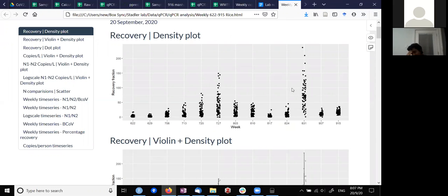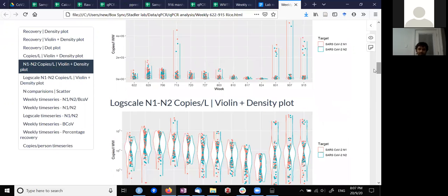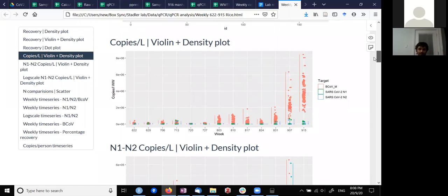There's another inaccuracy in the pipeline. So I'm using a concentration fold from wastewater to RNA as 1,000-fold because I'm putting in 50 ml wastewater and I'm taking out 50 microliter of the RNA extract. But there is a few steps in the middle where they were throwing out a little bit of the sample. So if I account for that, it's actually 500-fold, not 1,000-fold. If I adjust for that, even that will take this a bit down. Okay, I see. So those are the two explanations we have as of now.